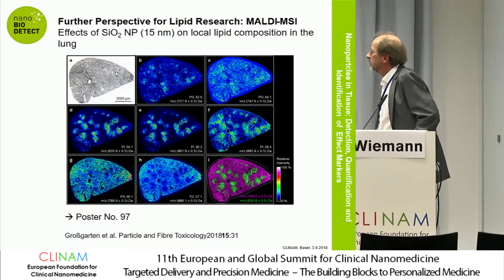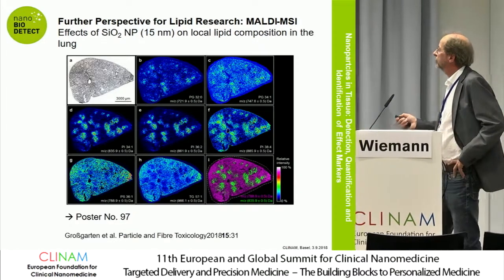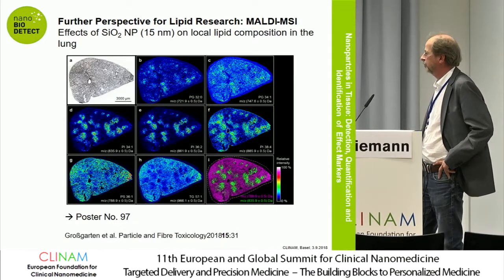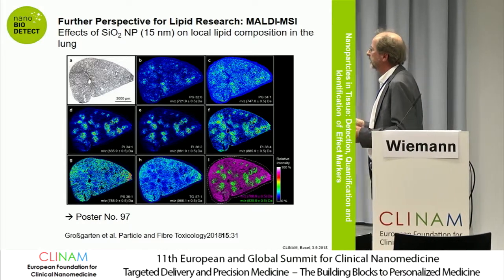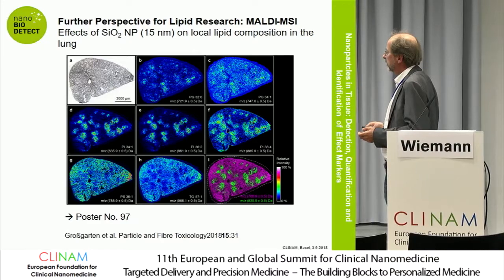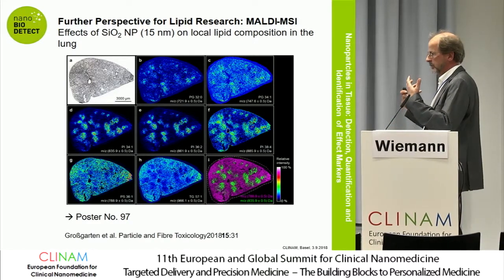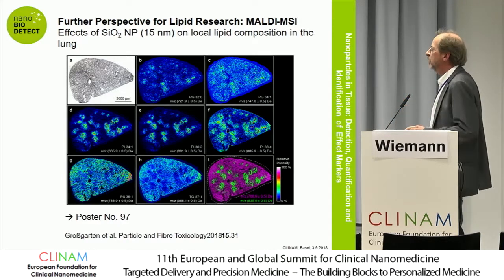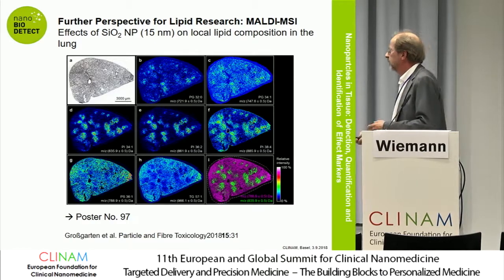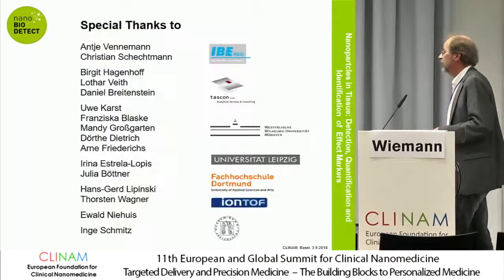And this is my last slide, just to give a glimpse of what is possible with the MALDI-MS technique. There is a poster number 97 if you are interested in MALDI-MS and the possibilities to analyze lipids in the lung. As I told you at the beginning, this is not a technique to go for the nanoparticles, but to go for the lipid differences, which in this case had been elicited in the presence of nanoparticles. If you want, I can explain it to you at the poster.